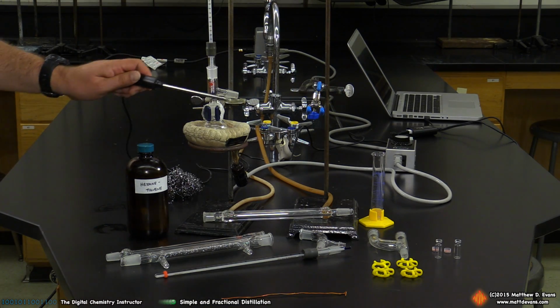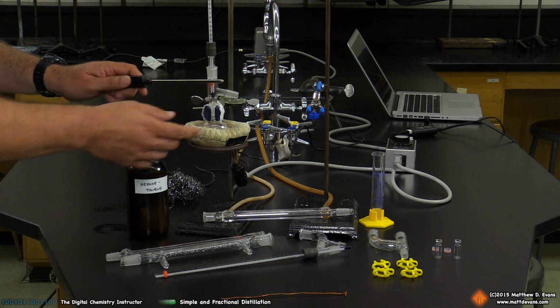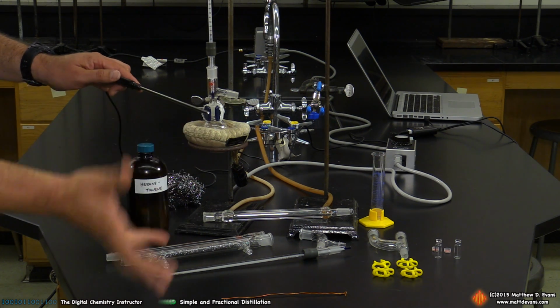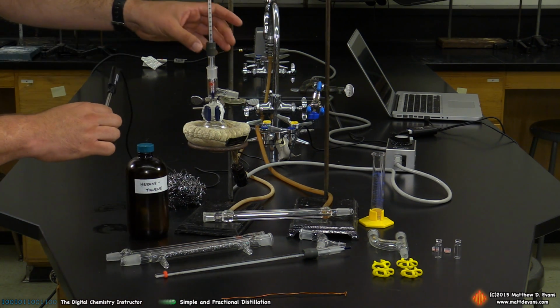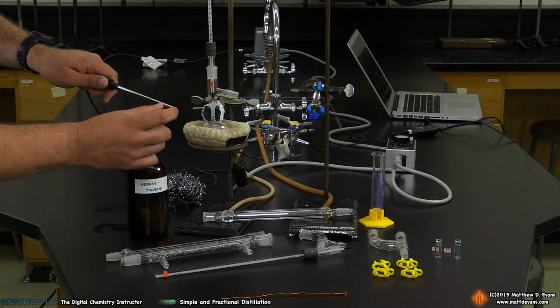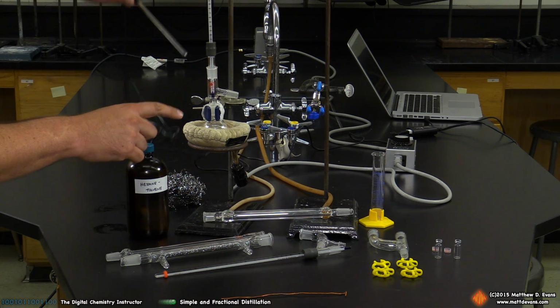Some of you may get a chance to use a digital thermometer. This is a Vernier setup. This is called a wide range temperature probe. I'm going to actually use this in the experiment, but I wanted to go ahead and show you the analog version of this setup. This is more traditional. This is kind of the fancy pants way. Now with this one, we're going to do the same thing.